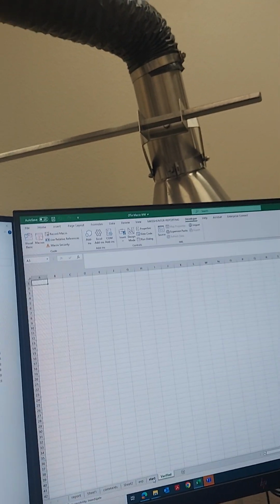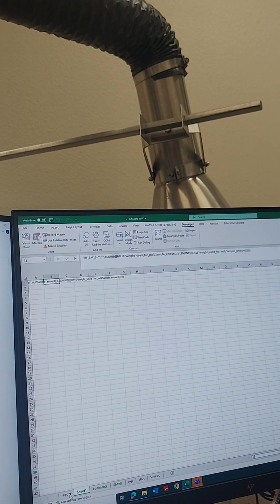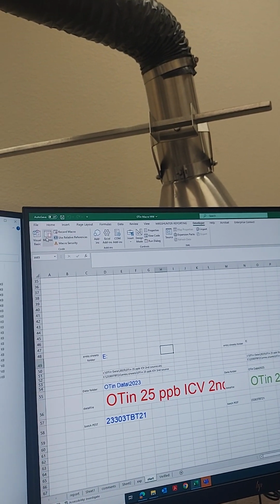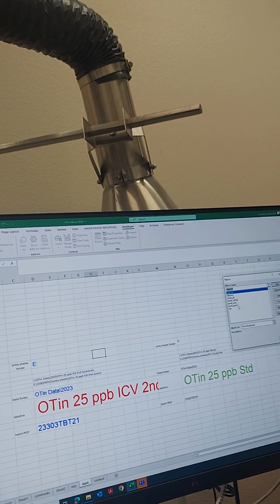What's happening? It doesn't show something in the files, addresses.